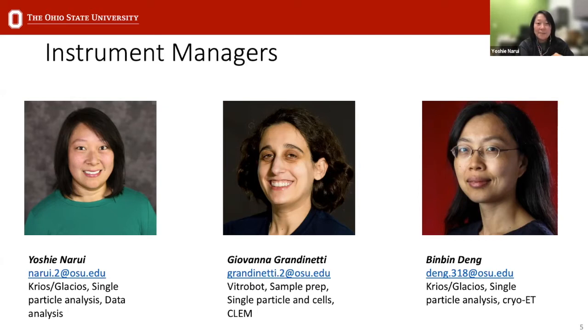And then finally, Binbin on the right, she is most experienced with electron tomography. So if you have a tomography project that you're interested in, I would definitely contact her. And then she also does help with screening and data collection on the Krios and Glacios.